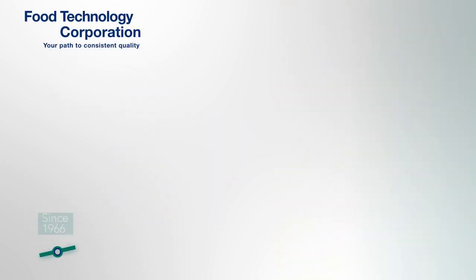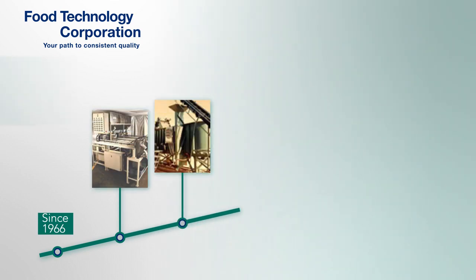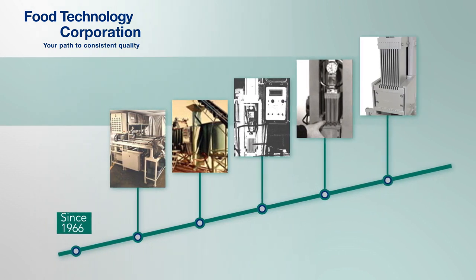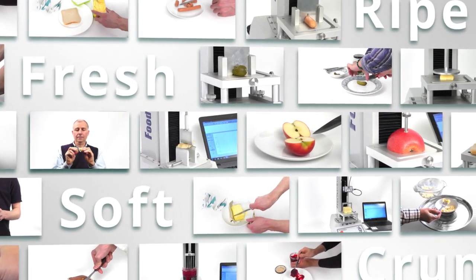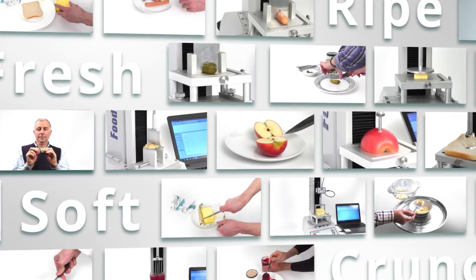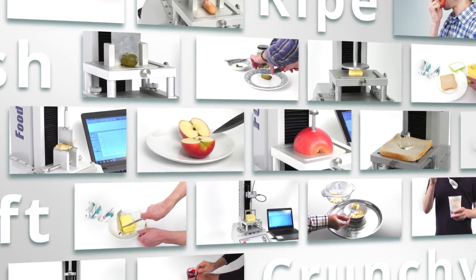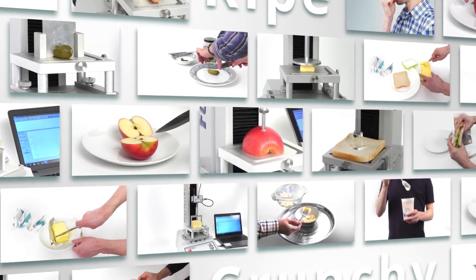When it comes to understanding food texture measurement, Food Technology Corporation has been producing texture measuring equipment since 1966. The Kramer shear cell was developed by FTC and is the benchmark pea firmness grading instrument from which worldwide calibration is standardised. They have the knowledge and experience gained from over 50 years of working with food producers and processors to correlate different textures with fresh, crunchy, soft, ripe and many more sensory experiences.